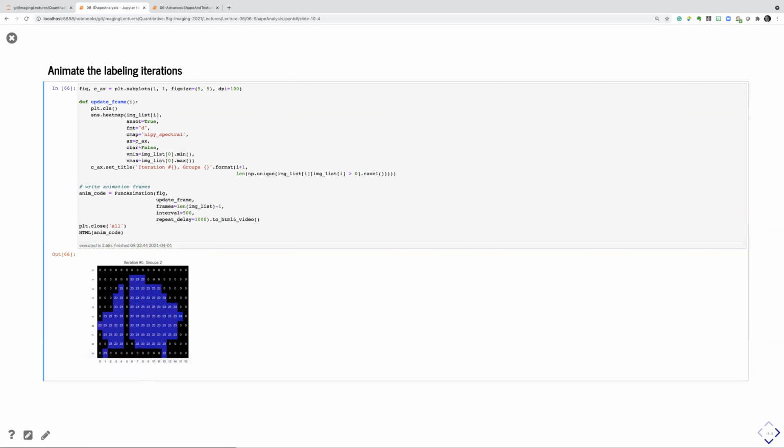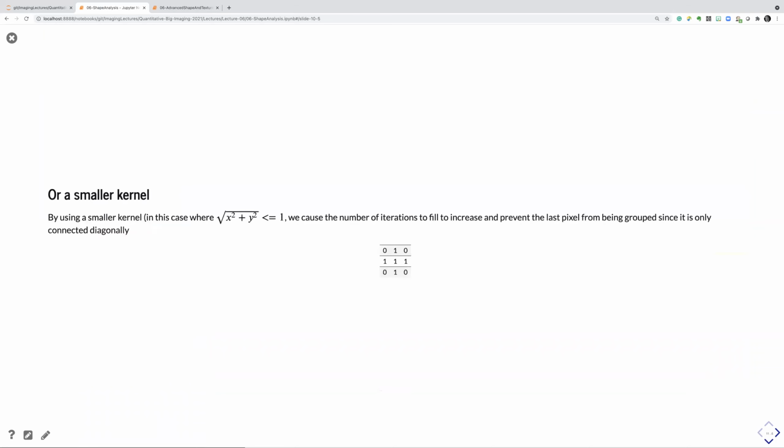Both objects are now labeled as the same. So if you have a larger neighborhood in your labeling algorithm, you can actually also cover gaps like this one, with the risk that you also label other objects with the same label, which you didn't want to. So be careful when you choose the neighborhood.